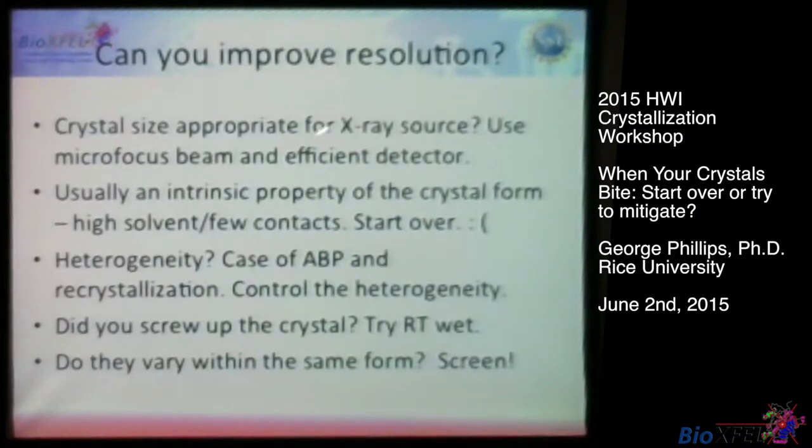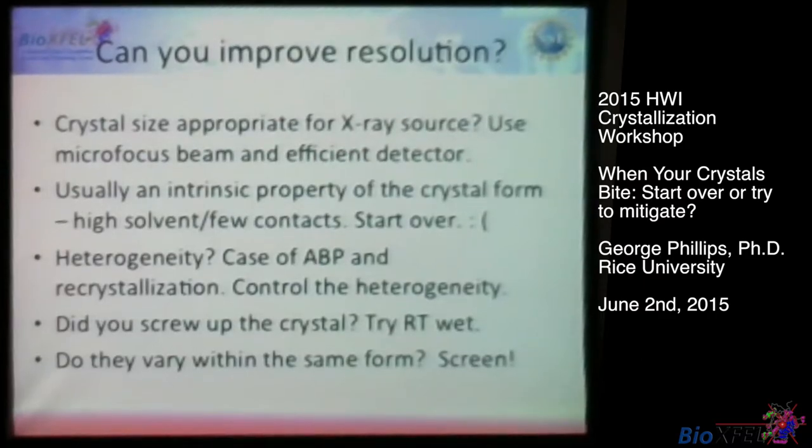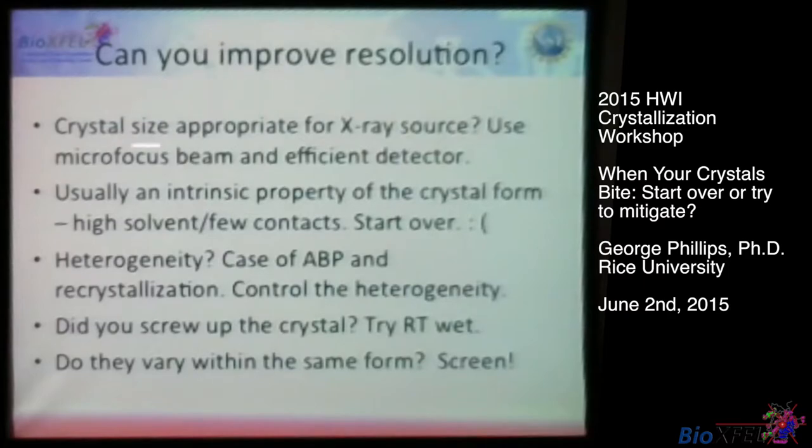Now, we've seen with the XFELs work on sub-micron sized crystals, so size has to be appropriate before you can even know if your crystal is good or bites. I mean, we've pretty much stopped doing screening at home on the rotating anode, because what happens is it'll go to the synchrotron and come back with a structure, when we didn't even see anything at home on the rotating anode with a 50 or 60 micron crystal. So modern X-ray sources, including the XFEL, are really getting us into a nice place in terms of possibilities for resolution.